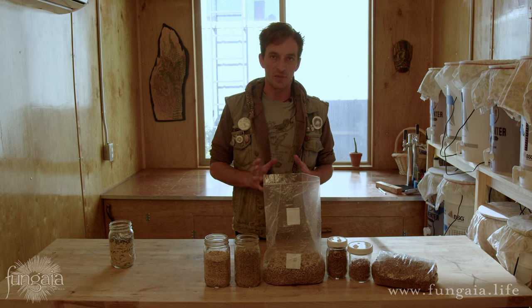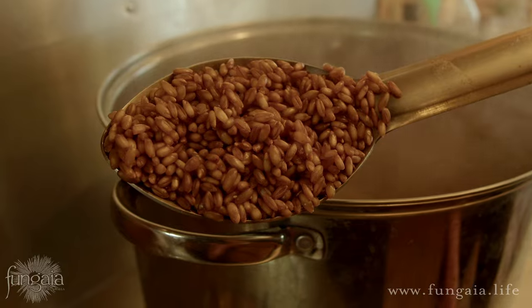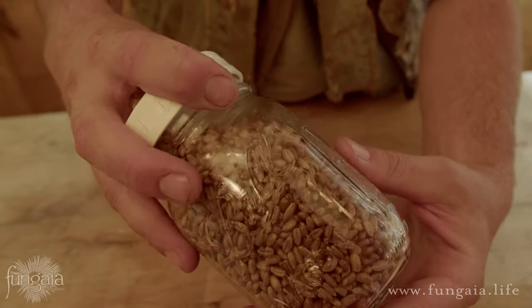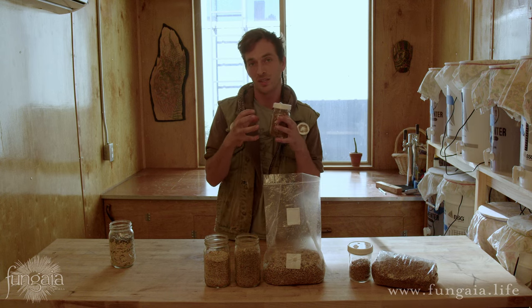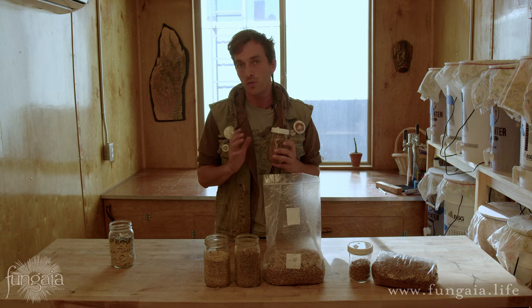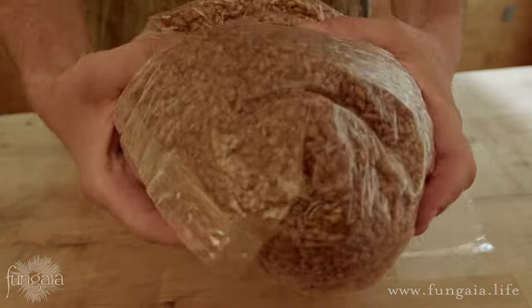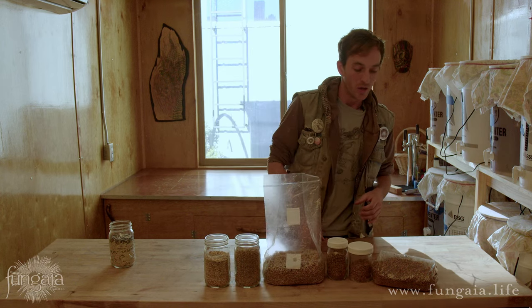In preparing grain spawn there's really one primary objective: we want to saturate the grain completely with water, and at the same time we want the outside layer of the grain to remain as dry as possible. Our third goal is to prepare the grain in such a way that the kernels remain intact. Once grains are exploded or broken open — sort of like oatmeal — they're far more likely to contaminate with bacteria and yeast. It's very easy for bacteria to eat porridge, but very difficult for mycelium.